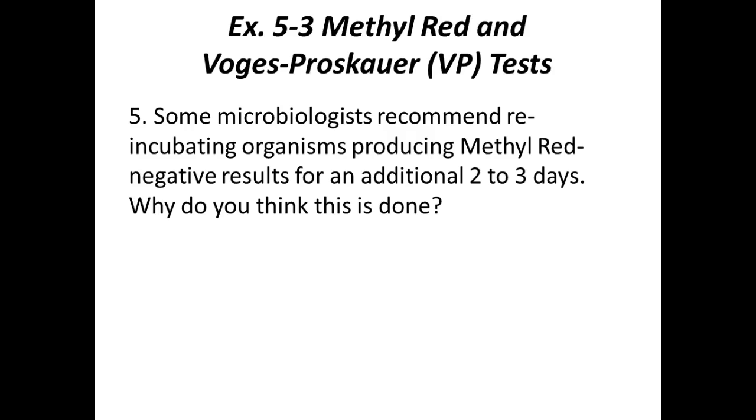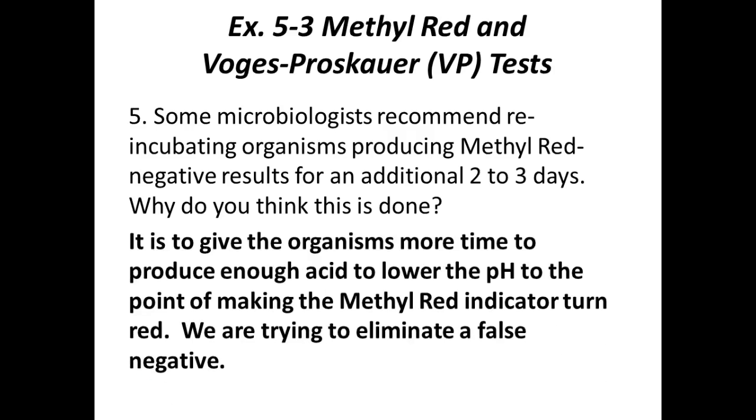Typically these are incubated for 2 days. Yours have been incubating for 2 weeks. We shouldn't have had and didn't have any false negatives. If you're going to be positive, you were positive. No problem there. So the longer it grows, the more acid, the lower the pH, more likelihood you're going to get a true result.